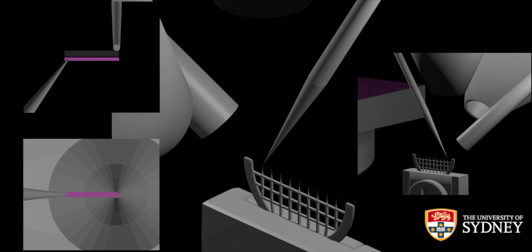On the Zeiss instruments, there's a little bit of backlash sometimes on the stages, so you move everything as close as you can. It's a pretty good mechanical stage. So you move everything as close as you can, and then maybe move the micromanipulator down the last say half a micron or something, and then the 2 pieces should be touching.